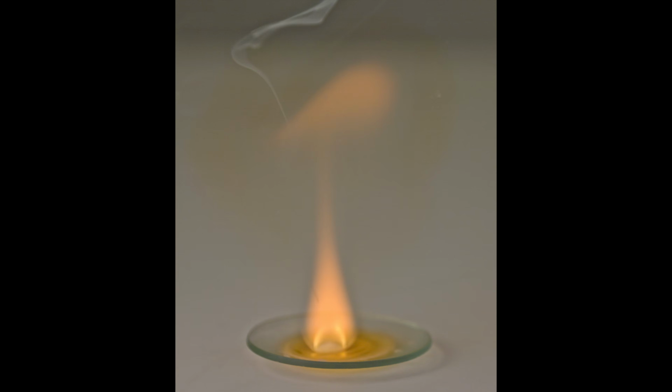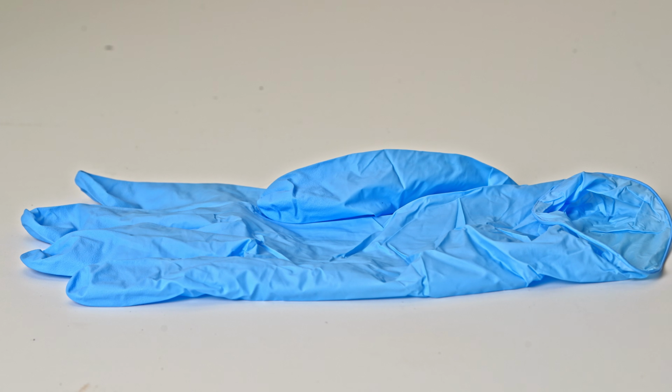It's not surprising that hydrazine behaves completely differently with such a super-concentrated acid. The latex glove ignited slightly faster than with regular fuming nitric acid.